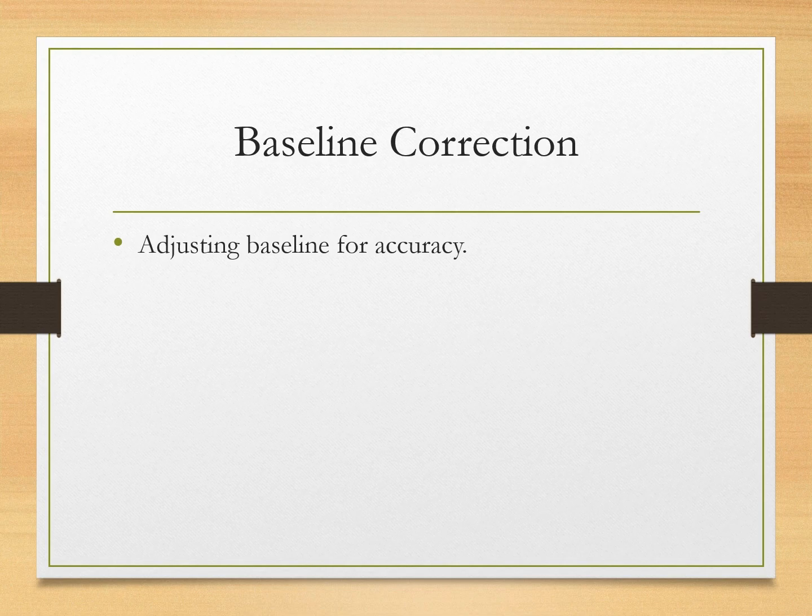Baseline correction removes background absorbance. A blank or solvent is used to set the baseline at zero absorbance. So the instrument is set at zero absorbance. It is adjusted before experimenting so that the baseline is set, there will be no chance for error, and accuracy is increased.